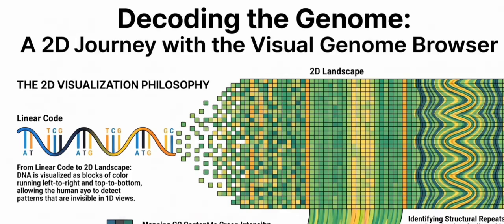It's crazy. In the example provided, a user takes a known consensus ALU sequence that is a massive 288 bases long. They paste this entire block of code into the search box while analyzing chromosome 1. But here is the critical step. They set the mismatch allowance as 60. They are telling the computer, find this 288-letter paragraph, but I will allow you to get up to 60 of the letters completely wrong. Now consider the computational burden of that request.